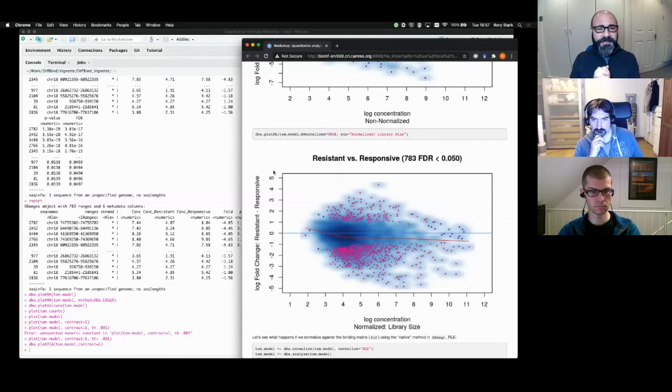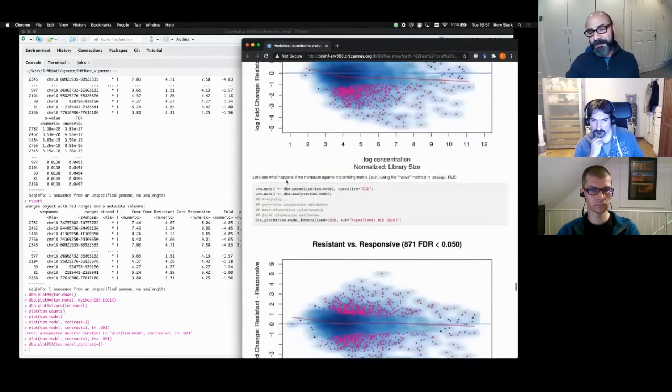So one of the other things that we've used, and there's a guy, Andrew Holding, in our institute, he just went up, I don't remember where he went, did some analysis where if you have a factor that you know shouldn't change, and he used for this breast cancer stuff CTCF, you can ChIP for both of those, and then you know the CTCF shouldn't change and the ER should change, so we normalize to this. We call peaks separately and normalize to both of them.